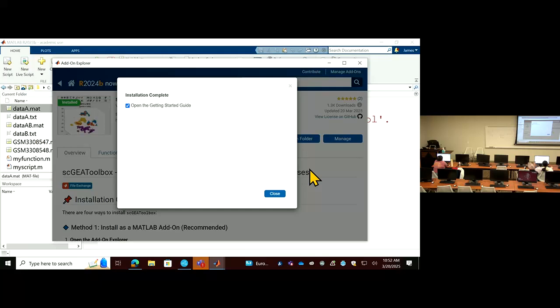Please just wait, maybe this function is in progress. Maybe just let it wait a little bit. It's still asking for admin permission at the end, but I think most of the files have been deleted. Yeah, I had the same problem. I'll just try adding one.